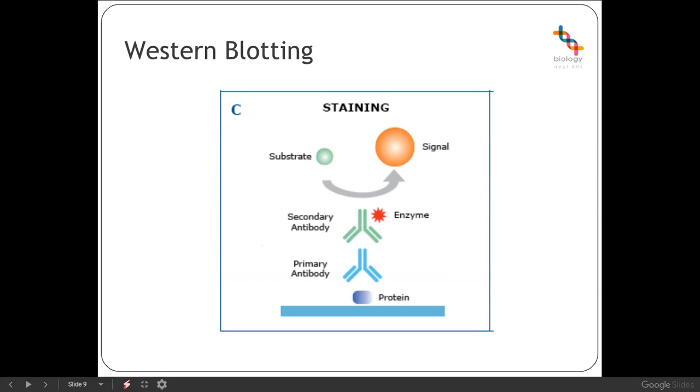We're then going to stain the secondary medium, usually referred to as a filter, with fluorescent labelled monoclonal antibodies or other reporters. In the same way as we just have, if we have our protein bound onto our gel, we've got our primary antibody, our secondary antibody with our enzyme, and when they bind, the substrate is catalysed by the enzyme, and that gives us our colour change signal again.